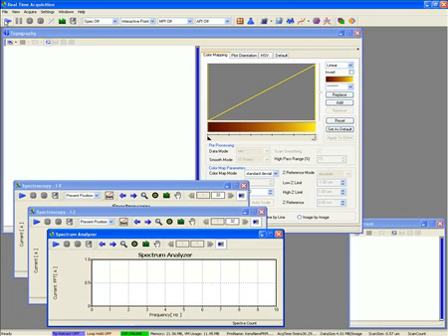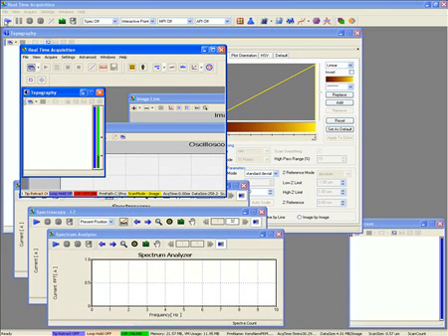The first major difference we've made is to the Start Scan button. Previously, we had one Start button that controlled every experiment. This could sometimes be confusing because you weren't always sure what experiment you would be running. So sometimes pressing the Start Scan button would result in a different experiment being run than what was actually intended.